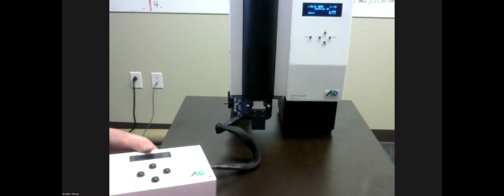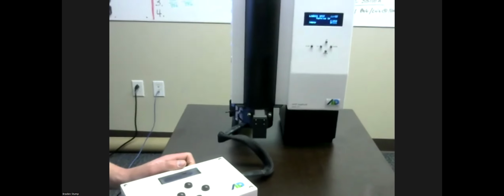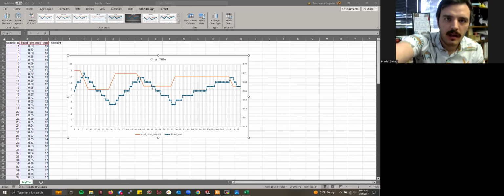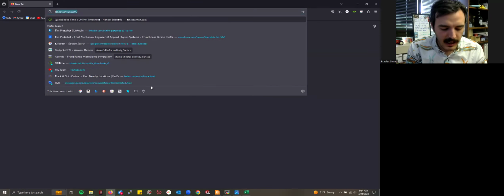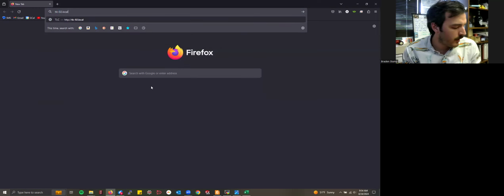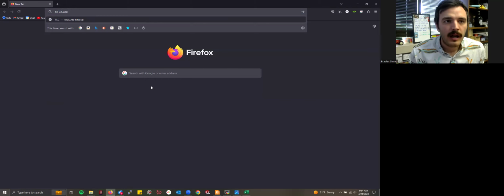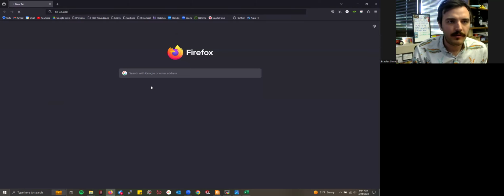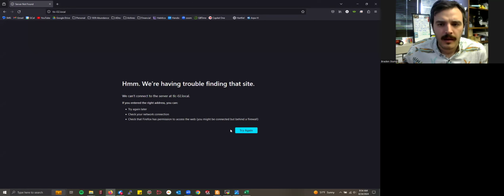So the last thing that I'm going to show you before we go ahead and close things out, as the TLC turns on, is some of the new remote access capabilities of the TLC. I'm going to go ahead and share screen again. Hello, everybody. And I'm going to type in TLC-02.local. So what's happening here is that on our local network, as I'm plugged in with Ethernet right now, and the serial number of this instrument is TLC-02, I am now able to access a very cool web page once it loads.